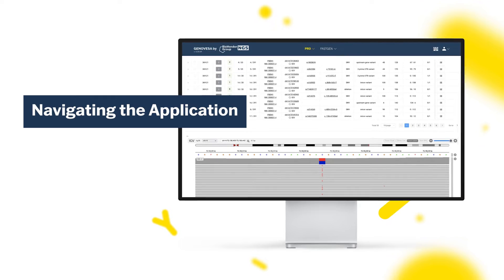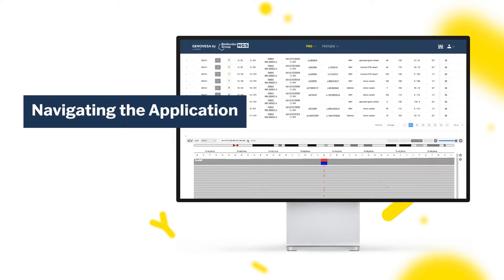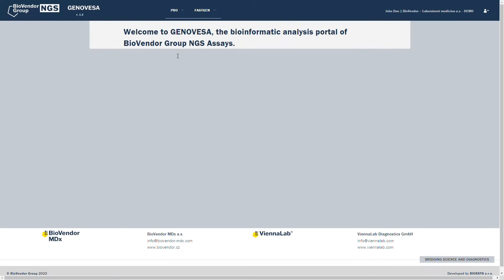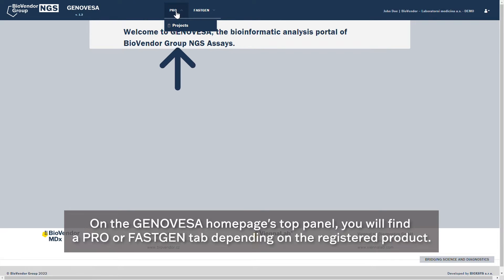Navigating the application. On the Genovesa homepage's top panel, you will find a Pro or Fast Gen tab depending on the registered product.